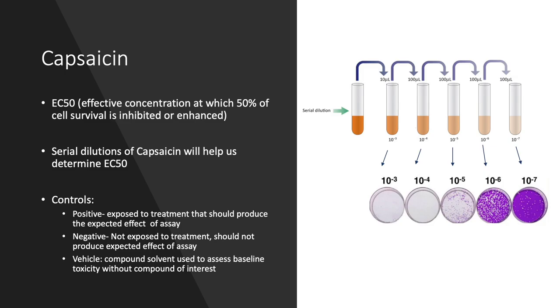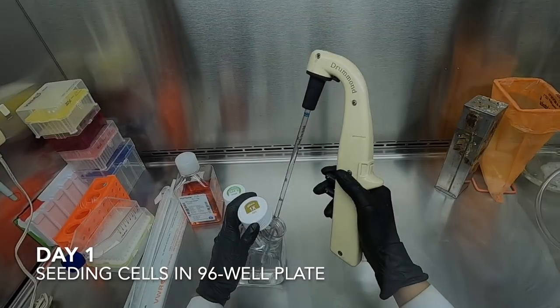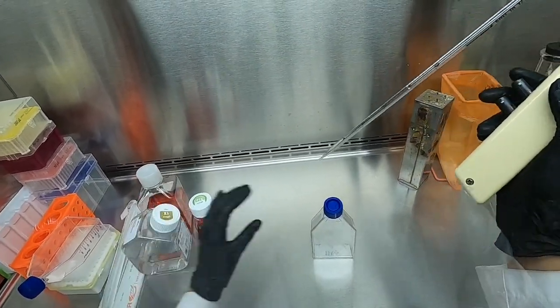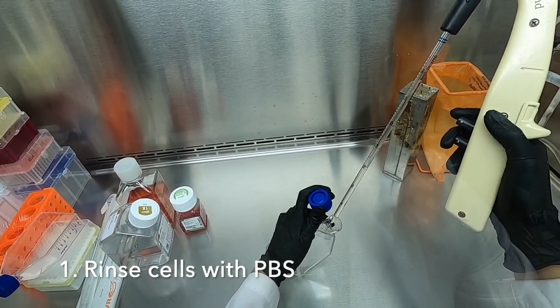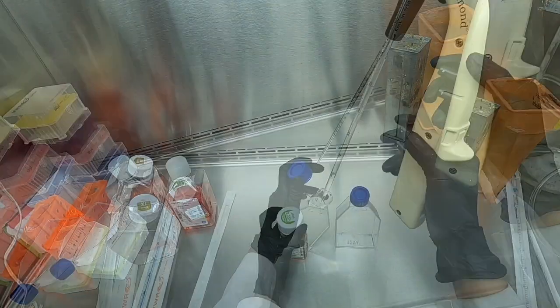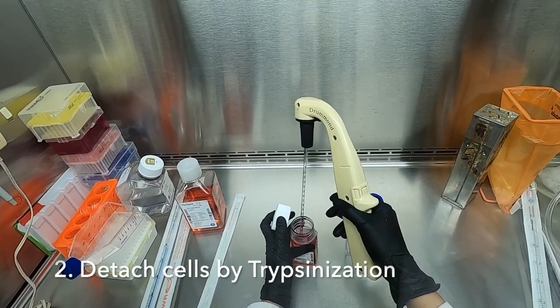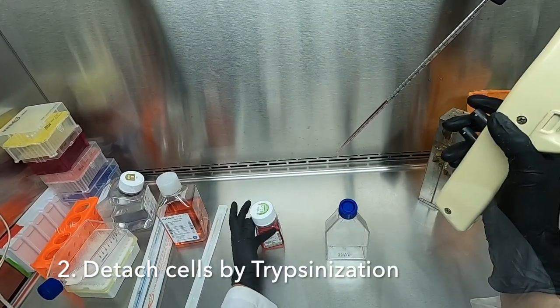So let's begin our experiment. We begin on day one by seeding cells in a 96-well plate. This is done by following the same steps that we used in our previous video for cell passaging. Briefly, we first rinse the excess FBS and media from our flasks. We then proceed to trypsinize our cells in order to detach from our flask.